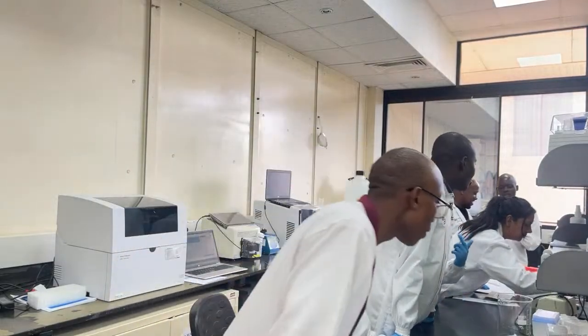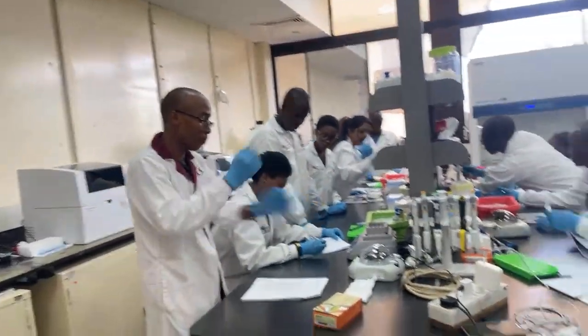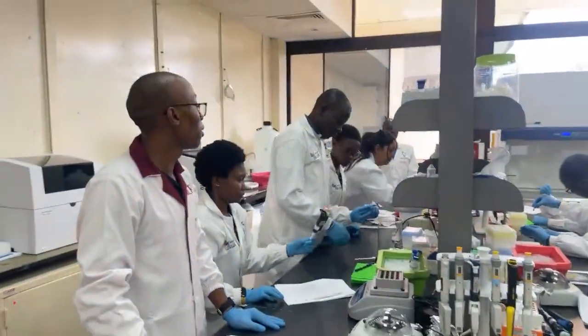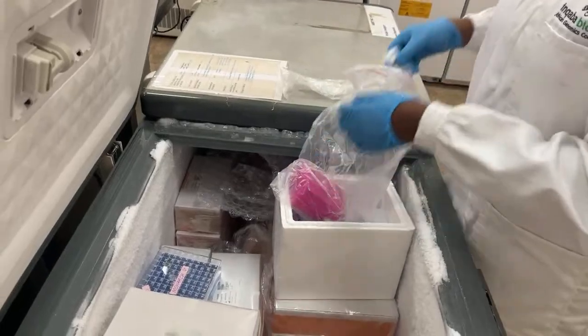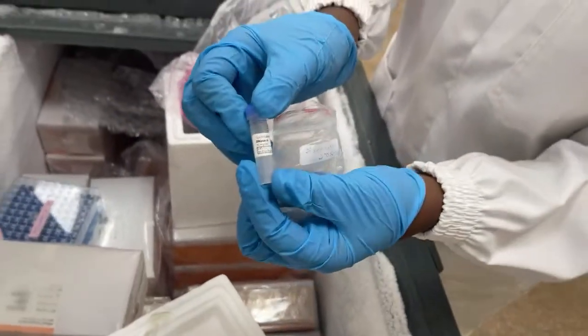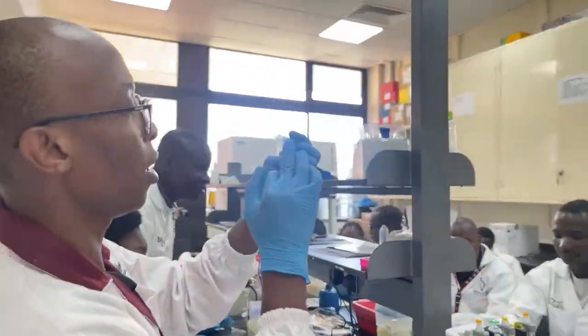Then we need the RNAs in here. Can you get us the RNAs? So just 20 microliters of RNAs. So it's coming, so we put it there. Set it on 20. I thought we returned it. We returned it. Yeah, we have 20.